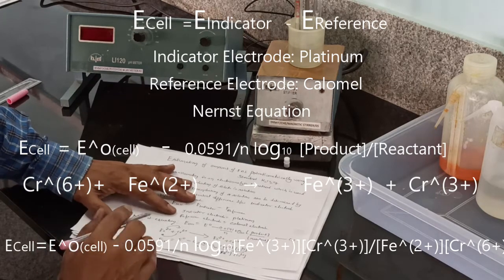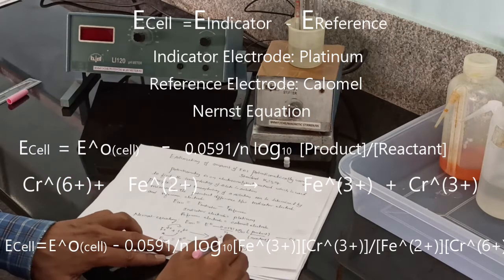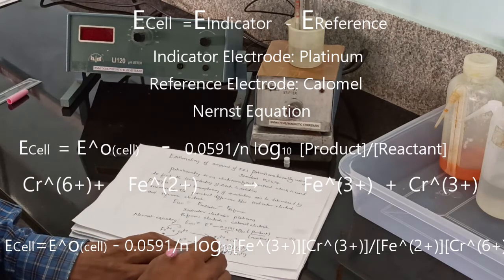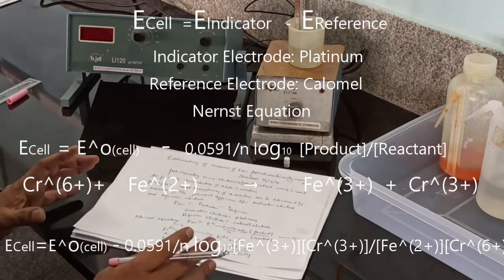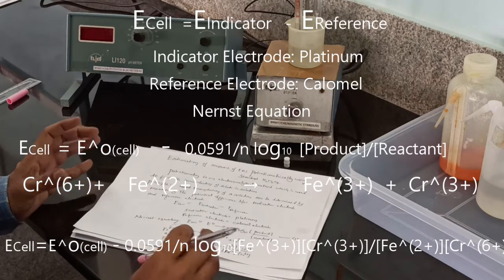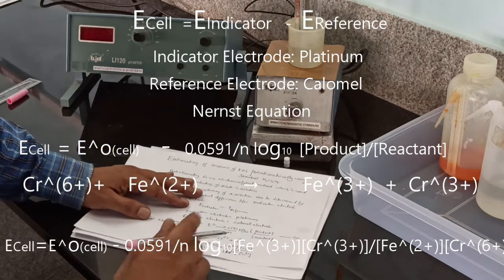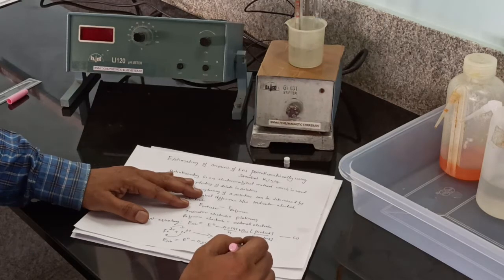At the end point, the EMF of the cell changes rapidly, that is due to oxidation of all Fe2 plus to Fe3 plus. According to this equation, at the end point, the concentration of Fe2 plus tends to 0, log infinity, and we don't know the value. That's why we can observe the large difference in EMF, and that EMF keeps on changing. After the end point, the EMF again changes gradually, a very small change in EMF, that is due to the change in the ratio of concentration of Cr3 plus by concentration of Cr6 plus.